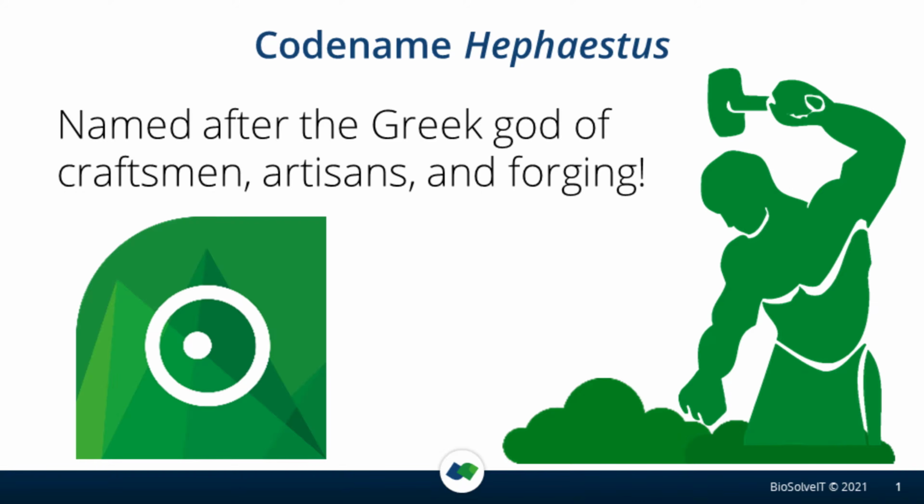SeeSAR 11 is christened Hephaestus after the Greek god of fire, metalworking, stonemasonry, forges, and the art of sculpture. SeeSAR Hephaestus is dedicated to you, the artisans of drug discovery, to help you craft, forge, and sculpt powerful drug molecules against human disease.